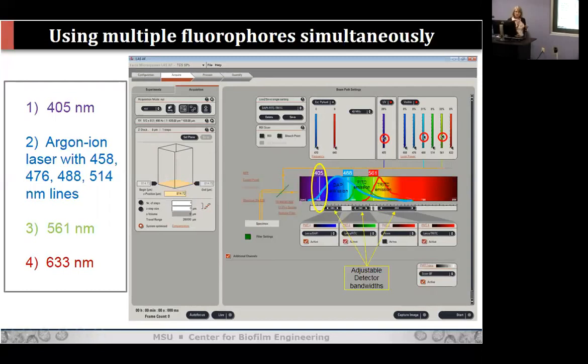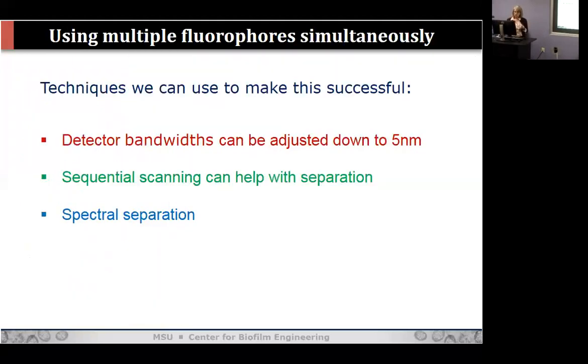We call these our detector slits. We can adjust the emission bandwidth we want to look at. But if you look at that area around 50 in the middle, where would you put that bandwidth so that you can get a clean picture of the green emission? It's not clear. You have to use some tricks to do that. We have them though. We have complete flexibility in the bandwidth we can look at, number one, that's huge.